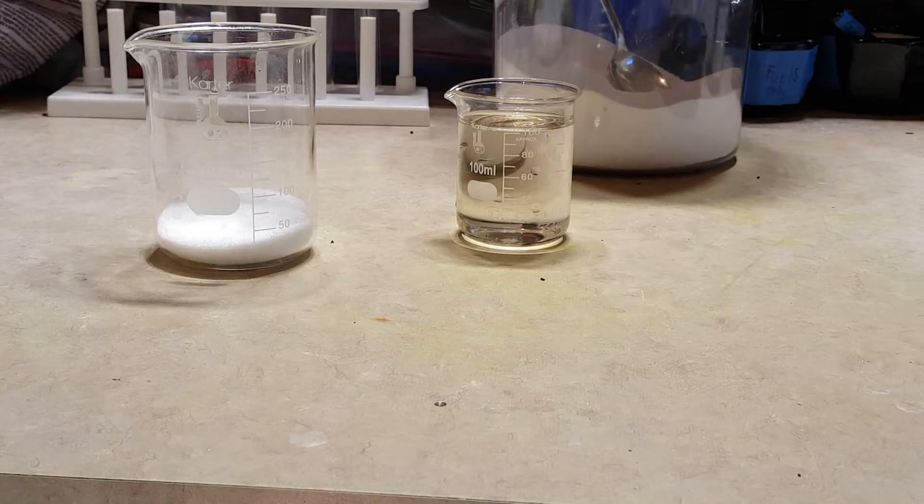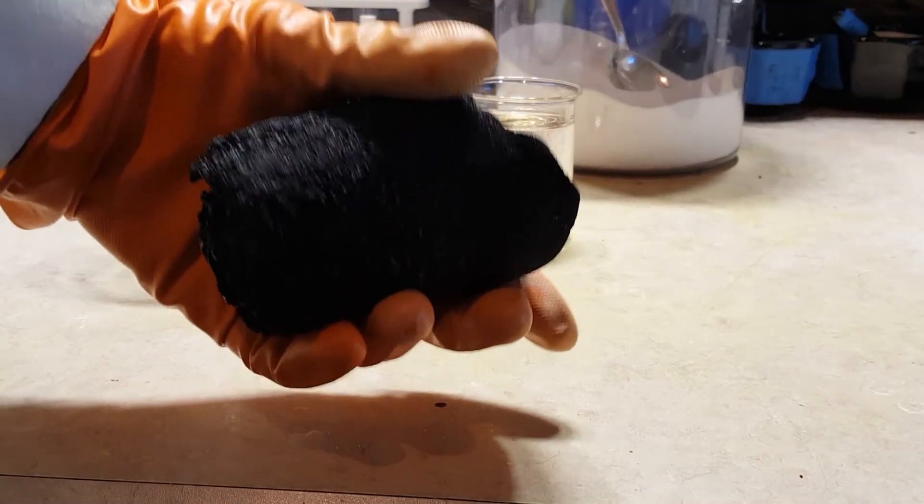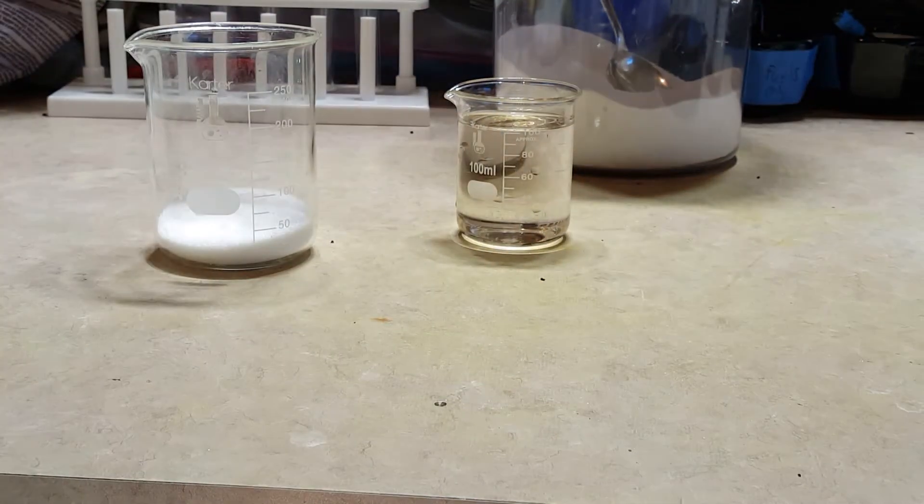Hi everyone, Frankiem here, and today I'm going to show you how to remove all the carbon from sugar without actually burning the carbon to convert it to carbon dioxide. I got this chunk of carbon from just a few grams of sugar earlier by reacting it with concentrated sulfuric acid.